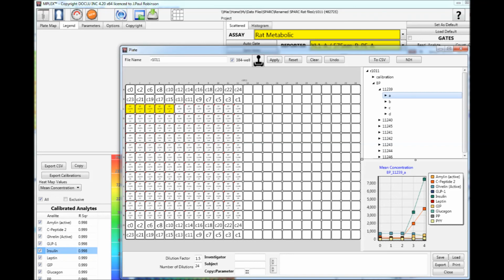This is a very comprehensive table, and you can literally add anything you want to each well by typing in the large box on the right, which will link that text to a particular well or many wells if they are highlighted.